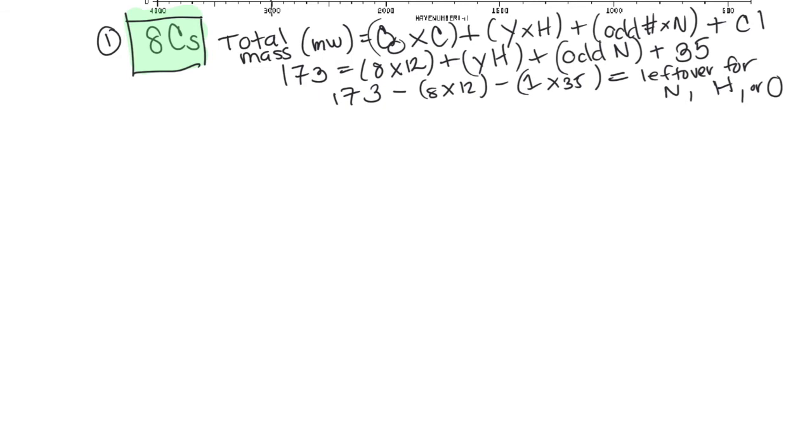O we try to consider, right? And then Br and Cl show themselves in M+2, and so does sulfur. And so C and H. So we have to assume any of those could be present. We've already addressed all of them except O. So I'm going to modify my formula to also include an O. We're going to see if it's reasonable to consider that O would be there.